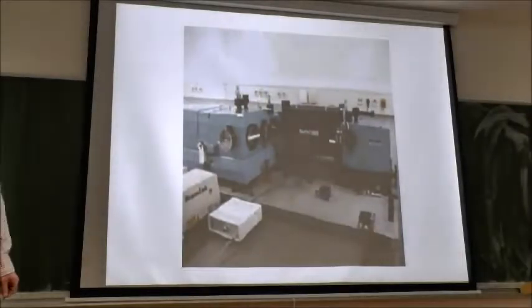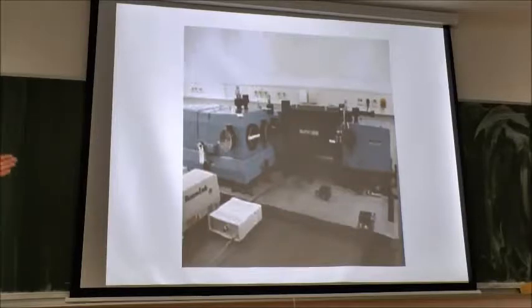So here I think it can be seen a little bit. I would like to show you the different designs of instruments. So this is experimental Raman. It can be seen in physics labs. It occupies the whole optical table, and it's used for Raman effect study itself.